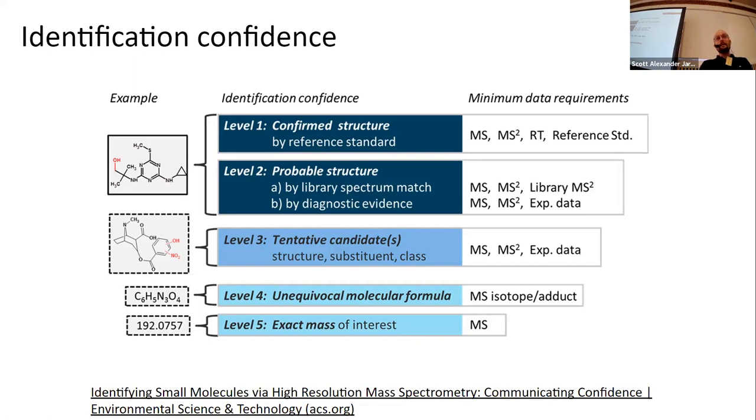What you'll come to see is that when we use molecular networking, we're mostly working at level 3 and level 2. It entirely depends on if you have what I like to call anchor points in your molecular network. So you have a reference spectrum that some of your features might link to, and then that allows you to start piecing together what structures might be possible from these other features.